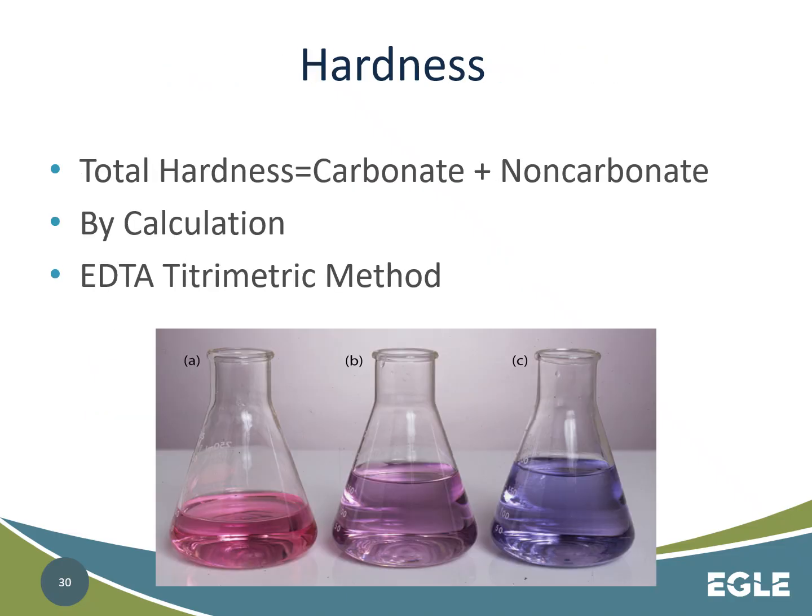Next we're going to talk about hardness titrations. Our plants that run surface water are required to monitor the amount of hardness, and some of our limited treatment softening plants will also want to monitor their incoming and outgoing hardness to make sure that their ion exchange is working.